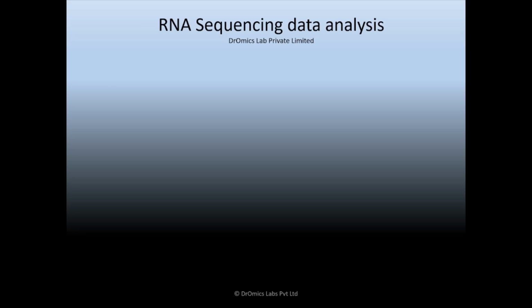But before we dive into these details, let's take a moment to appreciate the importance of gene expression in biological processes. So, what is a gene? We know that it holds the instructions for life, and how genes are expressed and regulated plays a crucial role in development, disease, and everything in between. Traditionally, studying gene expression posed significant challenges. However, with the advent of RNA sequencing, we now have a powerful tool that allows us to analyze the transcriptome. So, what is the transcriptome? It is nothing but the complete set of RNA molecules in a cell or tissue.